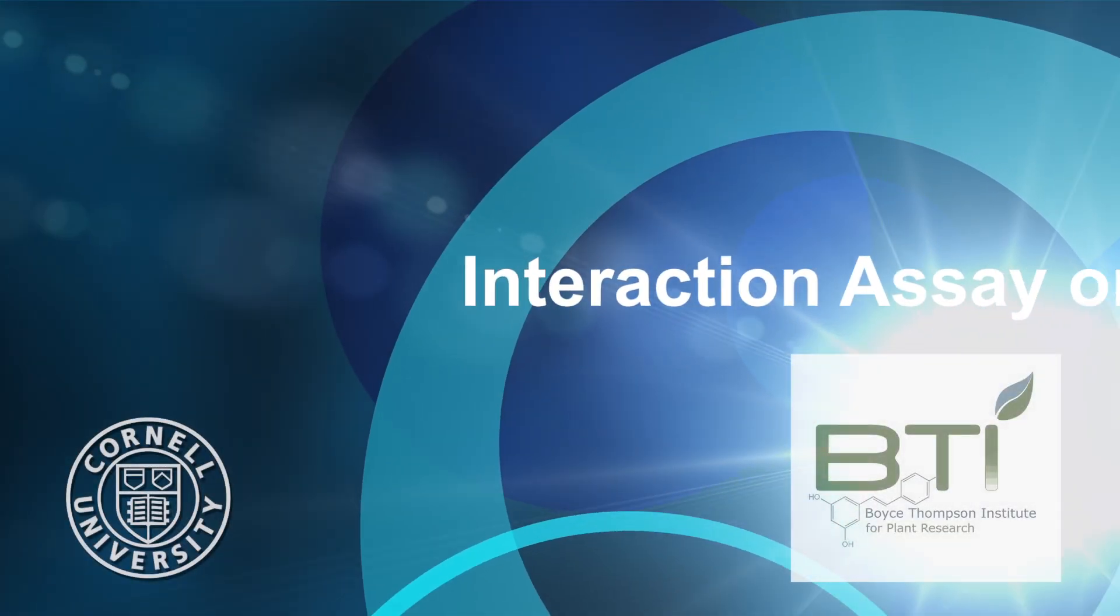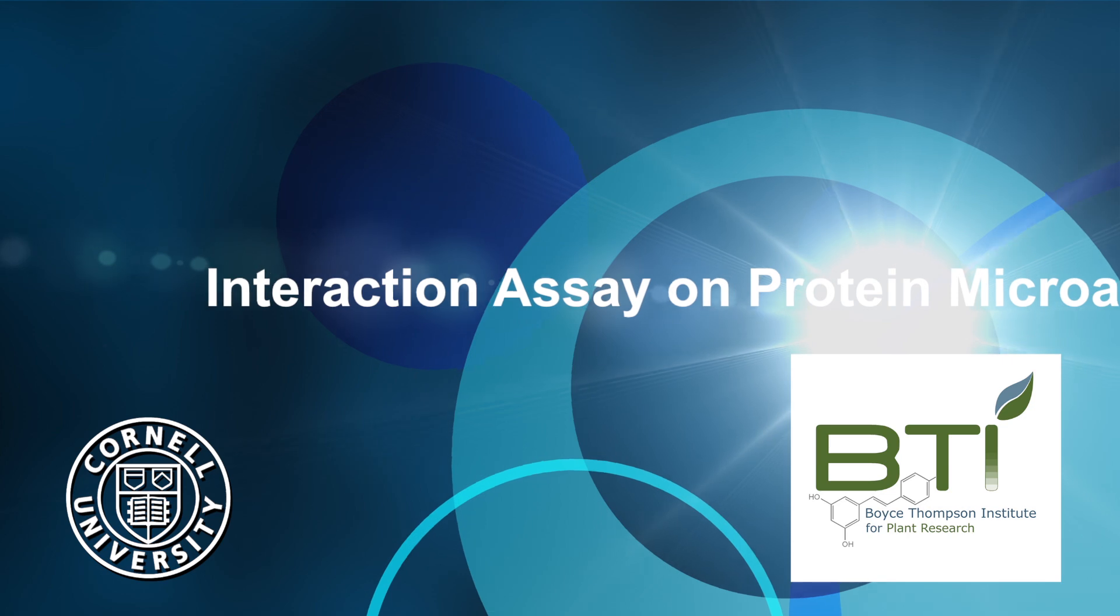Welcome. Today we're going to describe how to detect protein-protein interactions using a protein microarray.